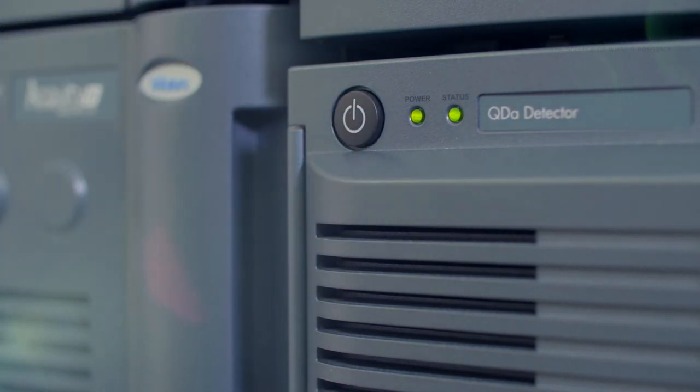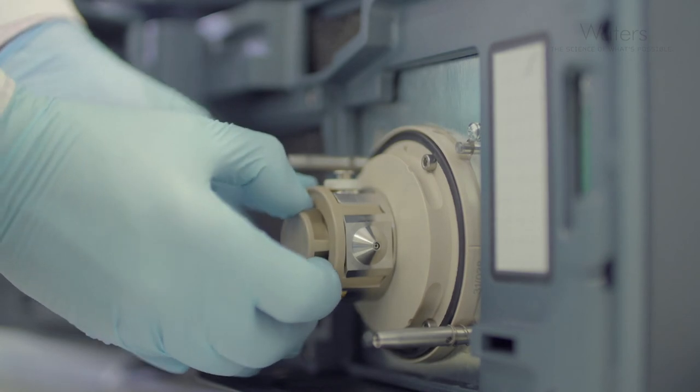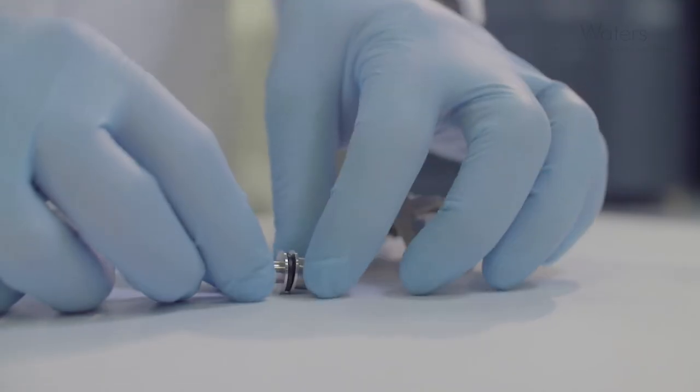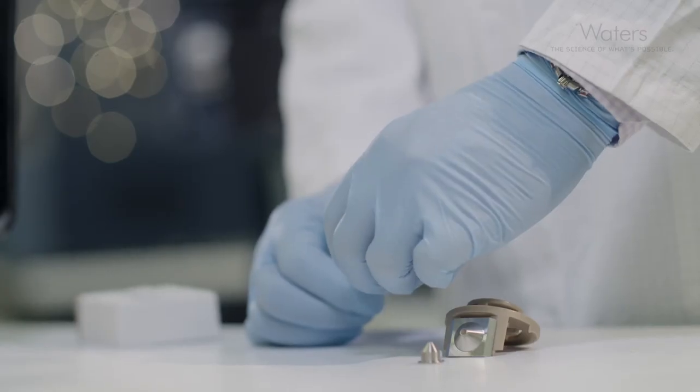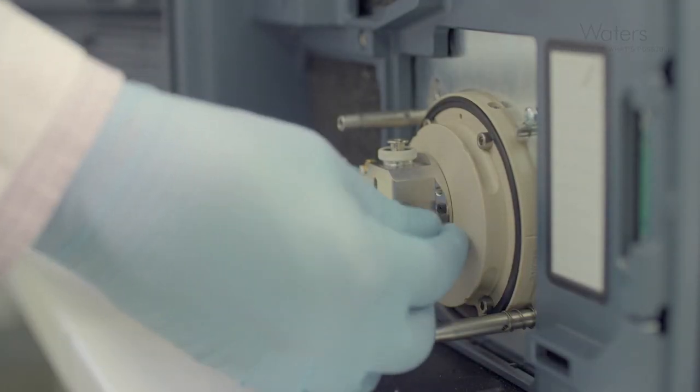Secondly, the sample cone. This has been designed so that the mass detector is protected from the sample spray. If it does require attention, there are simple tool-free access to this consumable component. This can be replaced very quickly with minimal instrument downtime.